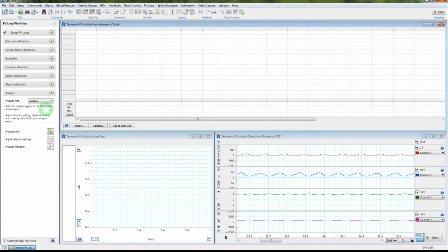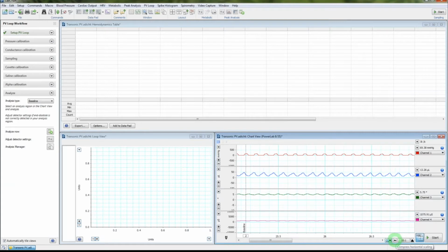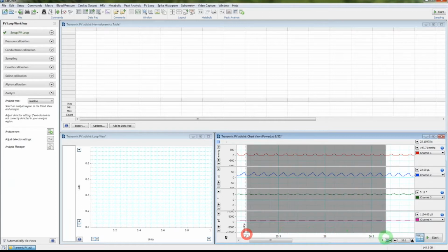The important part here for our discussion, though, is the Analyze section. So clicking on Analyze allows us to analyze the data. I'm going to select a section of data here surrounding my baseline content. That's the area we designated that we wanted to analyze. And normally you're only going to select 10 loops or so. You can do a little bit more than that, a little bit less than that, but you want a section of data representative of the area you want to analyze.